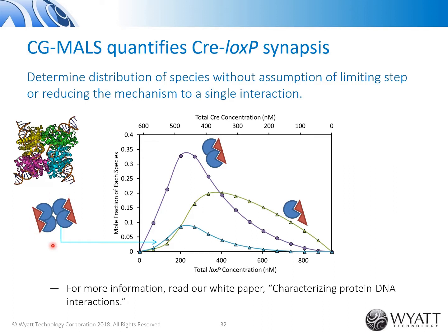This type of analysis can really help with interpreting orthogonal measurements like cryo-EM or other structural analyses. And we have a few examples of these types of measurements in our bibliography, and I encourage you to look at those.